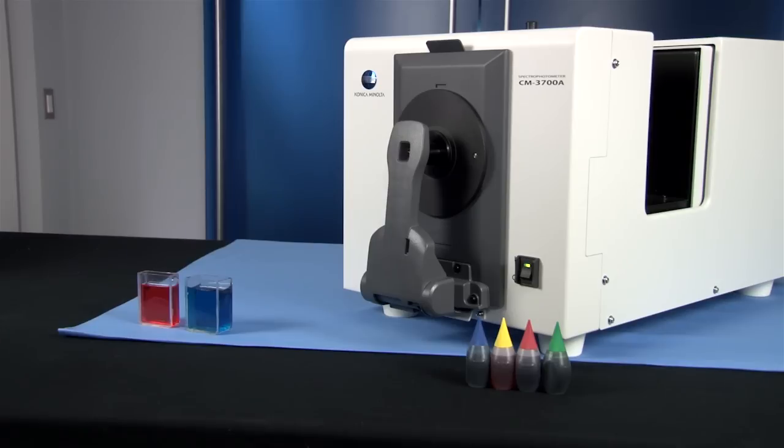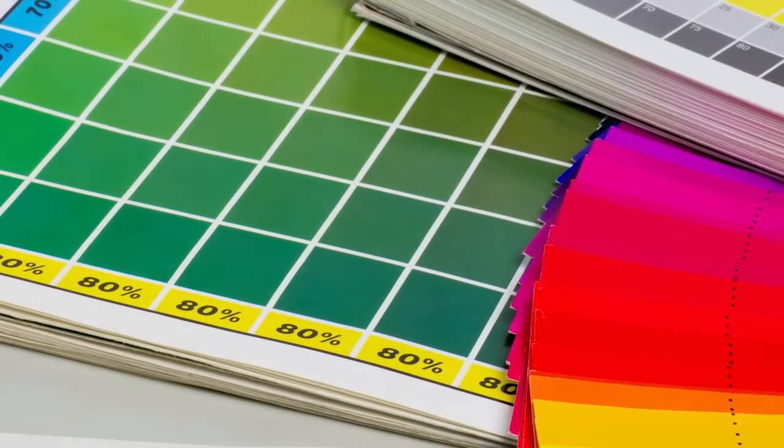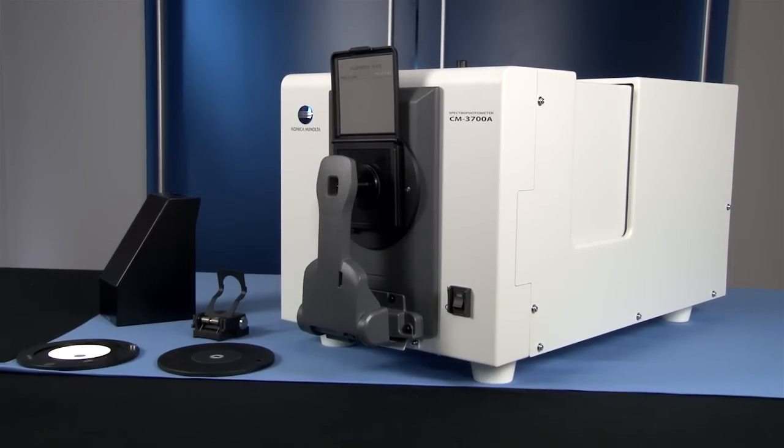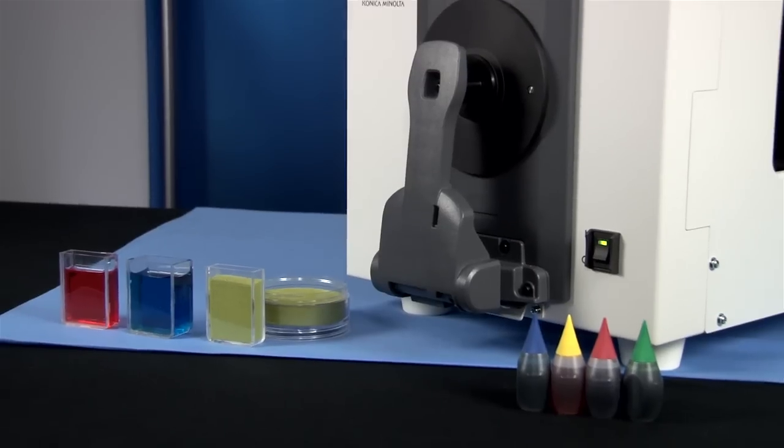The CM3700A is designed for color formulation, analysis, and quality control inspections within research and manufacturing environments. This versatile spectrophotometer precisely measures the color and appearance of a wide range of samples.